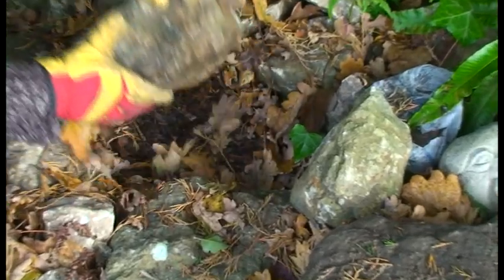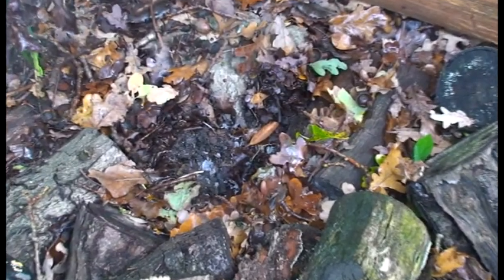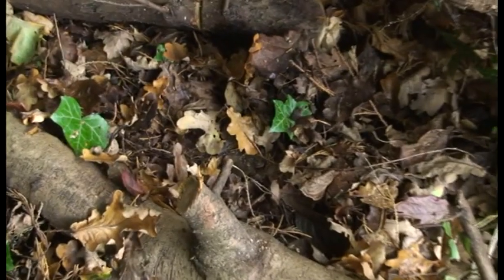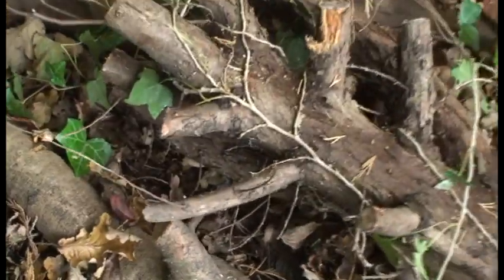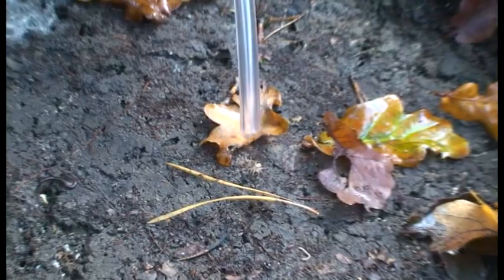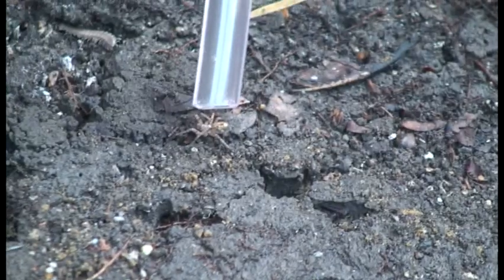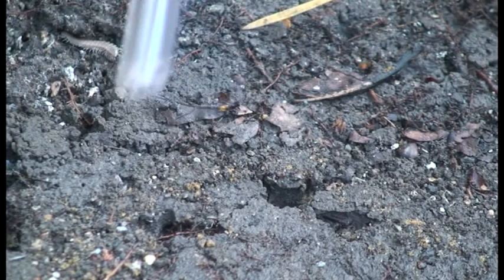But first, you have to find some. When you have found some mini-beasts, place the longer collecting tube close to the specimen you have identified and give a short sharp suck on the other tube. A short sharp suck is more effective than a long slow suck when collecting mini-beasts.